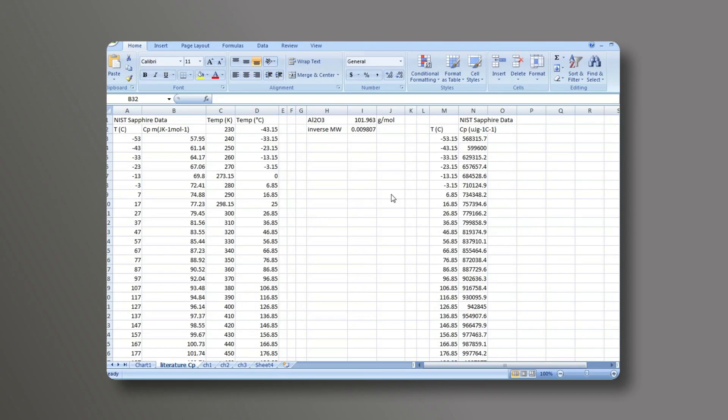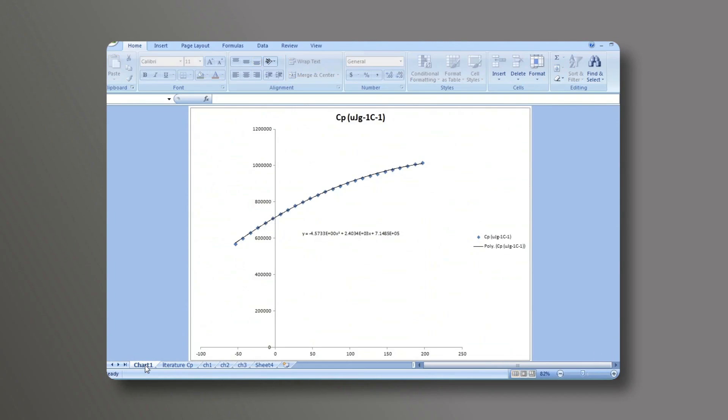At this point, I will plot on the x-axis the temperature and on the y-axis the heat capacity as done in chart one. The data has been fitted to a second order polynomial and now these values for this entire equation are written down.